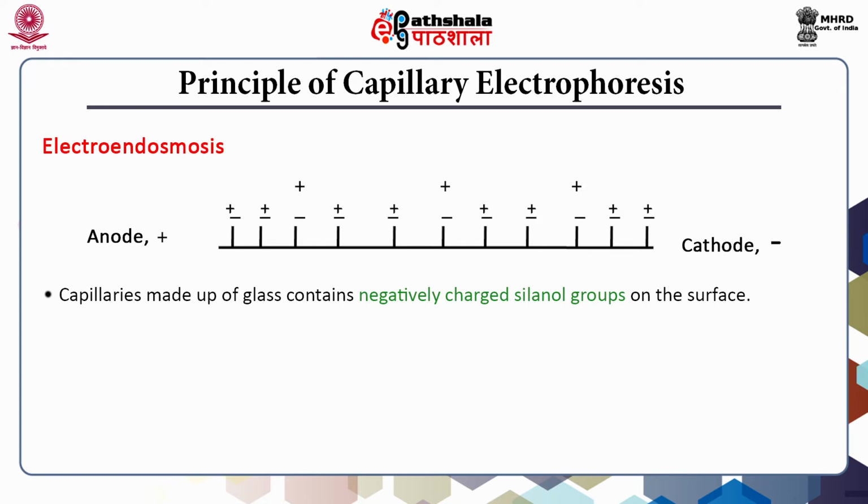The buffer also has anions and cations. Cations from the buffer will bind to the negatively charged silanol ions, and these charges will remain virtually immobile.